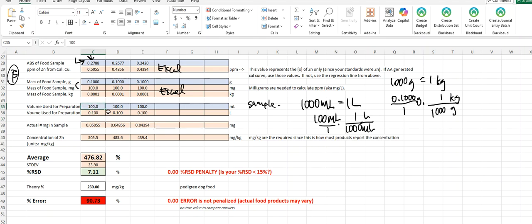So that way you've got a template. And if you did not use 100 but 50, you can key that number in, and all of a sudden the number begins to update. Or, hey, we did 25 mils. I key in 25, the number updates because that number is used in other calculations down the board. So we used 100 mils in this example.